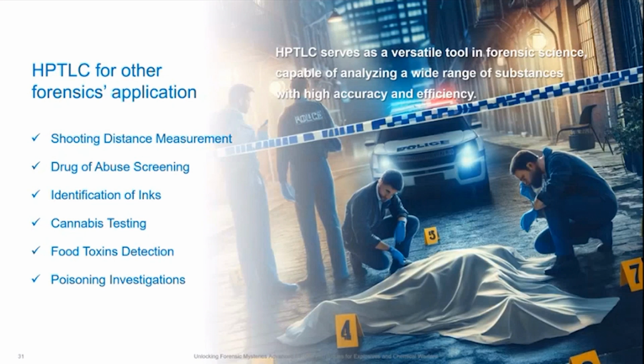Then cannabis testing has become very popular in the US and in Europe. We have a lot of legal cannabis where the THC is below 0.5, or in Switzerland 1%. And this testing has to be done on each and every sample. We can also see strains of cannabis or different kinds, and when you harvest, if you need the THC, when you have the highest content.